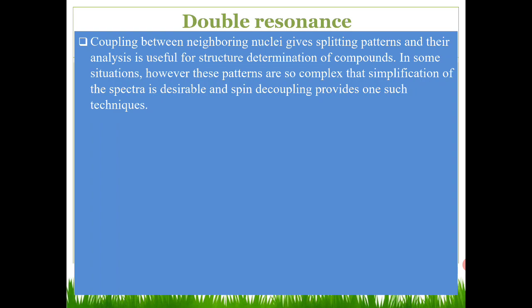We have discussed that there are four parameters that give you correct information about the NMR spectra, which you have to use when you analyze them. Out of those, one is the splitting pattern, the coupling constant, and so on. If you can make some changes to the splitting pattern, that is what we did in the deuterium technique also. One more technique that will change the splitting pattern is double resonance.